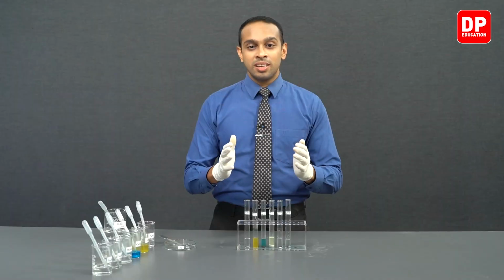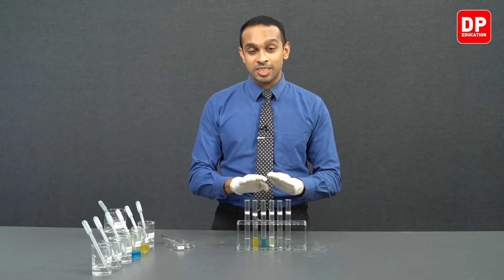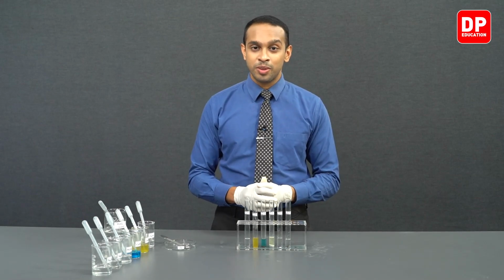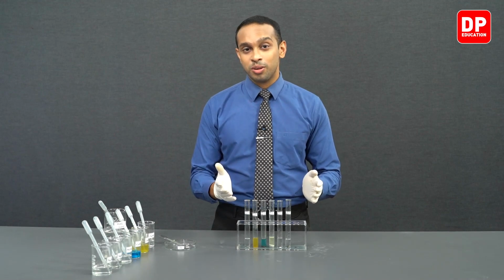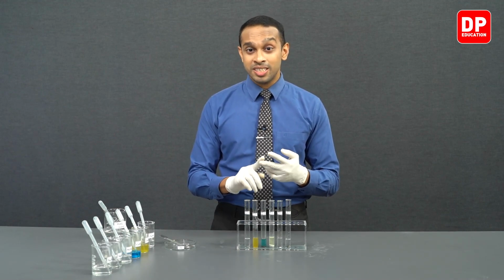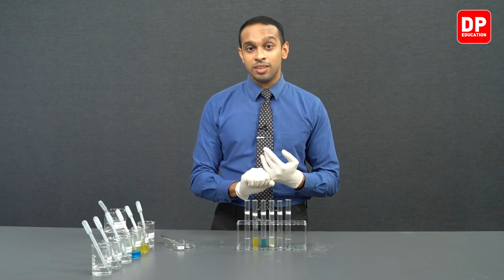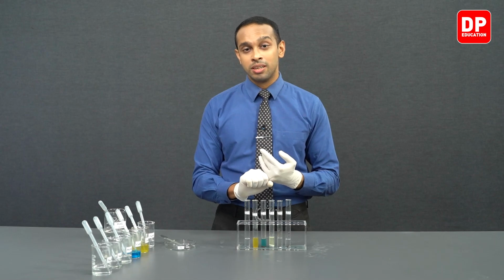So we do know lead will come in the 5th place in the elements that we were considering today. So out of the elements that we were considering today, the most reactive was sodium, then magnesium, then zinc, then iron, and on the 5th place, lead. So lead was only capable of displacing copper.